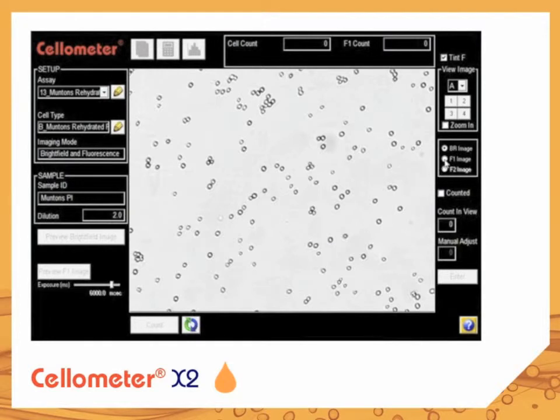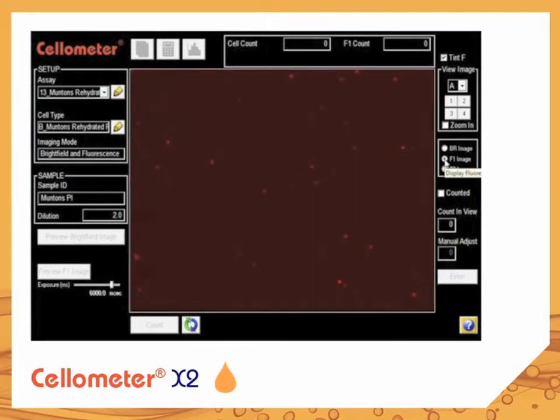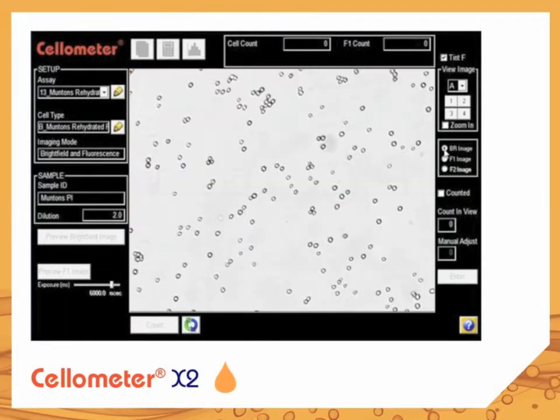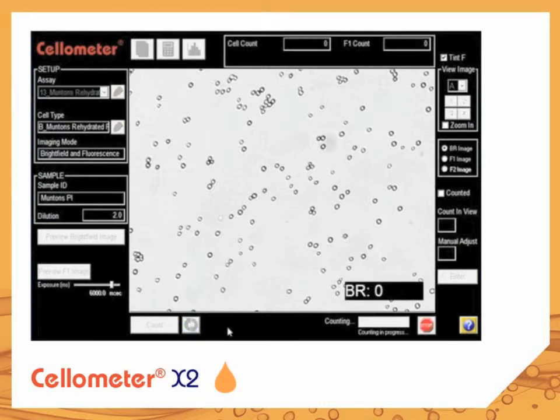Brightfield images are taken for total cell count. Fluorescent images are taken for dead cell count. Cellometer then takes the cell images and analyzes them based on preset parameters to determine live and dead cell concentration and viability.